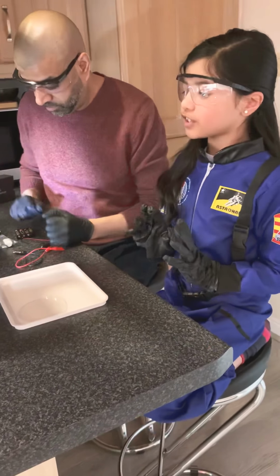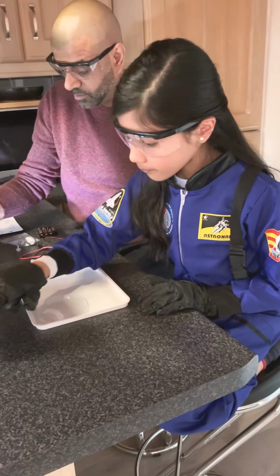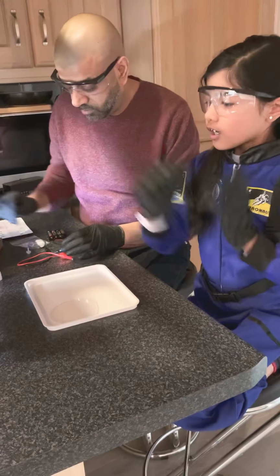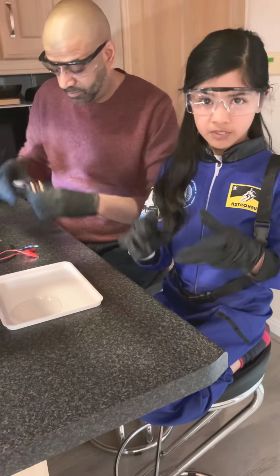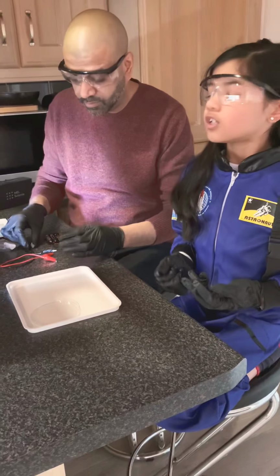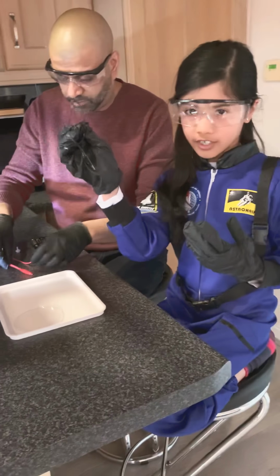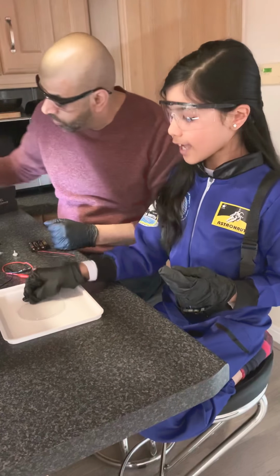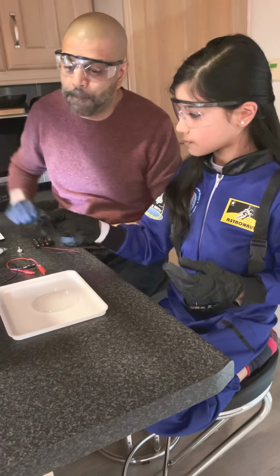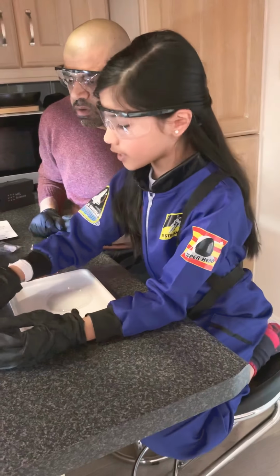When you get the starter kit, you'll need to take the smartphone clip-on macro lens. And from the set, you'll need to take the battery holder, the bottle nozzle, some protective gloves. You need the red crocodile clip wire, the black crocodile clip wire, a pin opener, and a petri dish. And you'll also need to take the tin chloride.